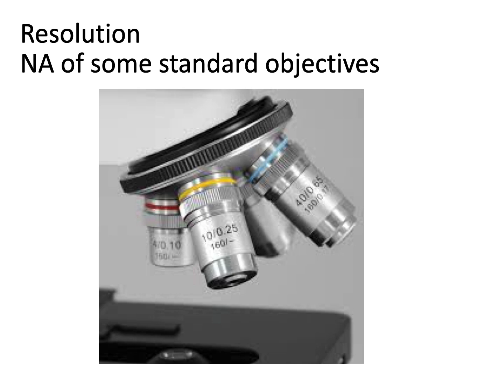They've already figured out the numerical aperture, so that was nice. But I wanted us to understand how we got there. So those numbers are usually written on the objectives too. And then there's oftentimes some other objective-specific information, like maybe the tube length of the objective and slash the thickness of the cover slip that should be used. So that's shown here. There can be other information put on the objectives too.